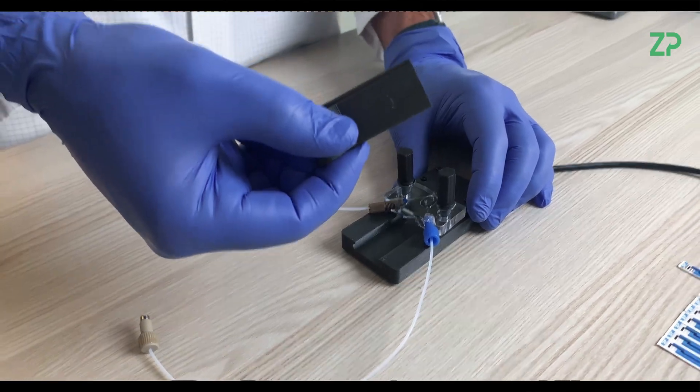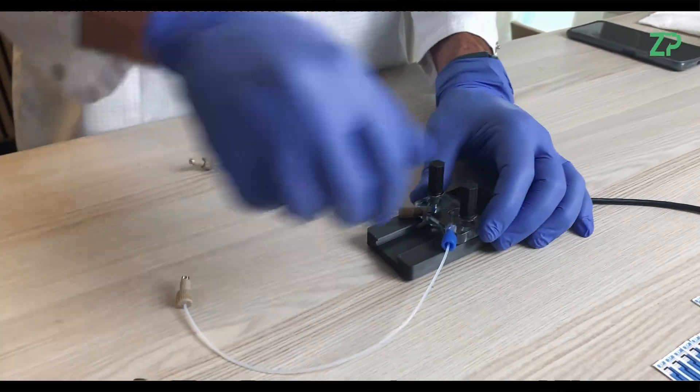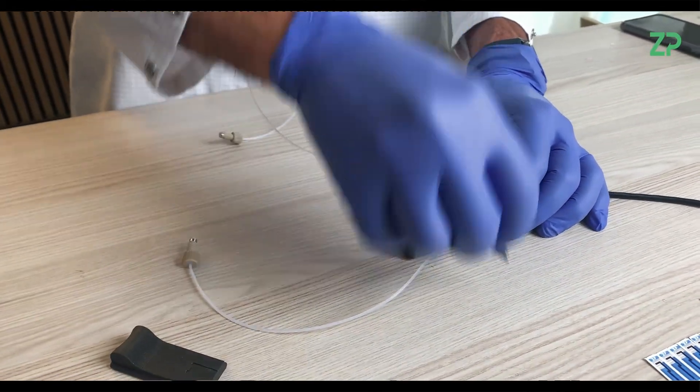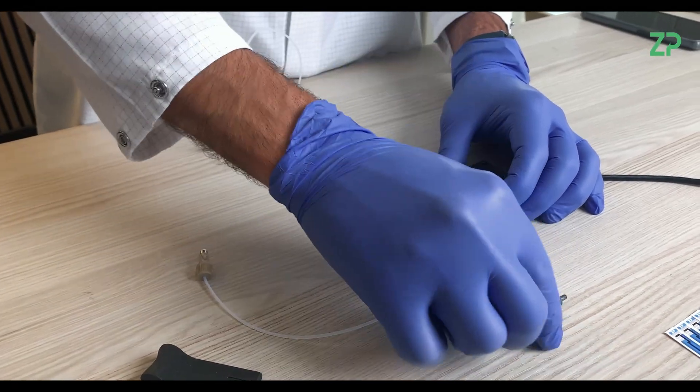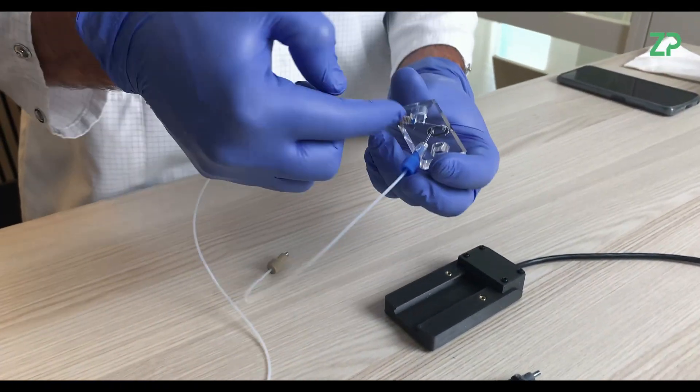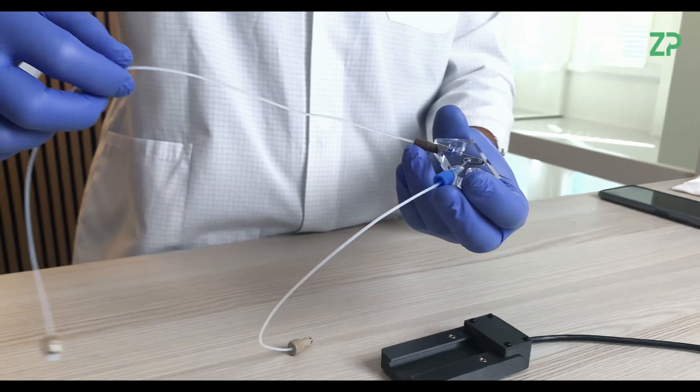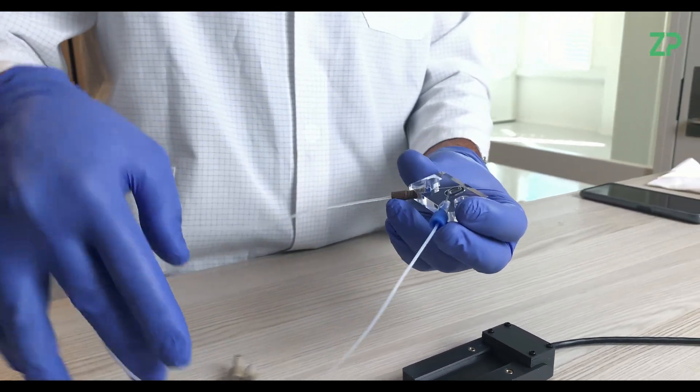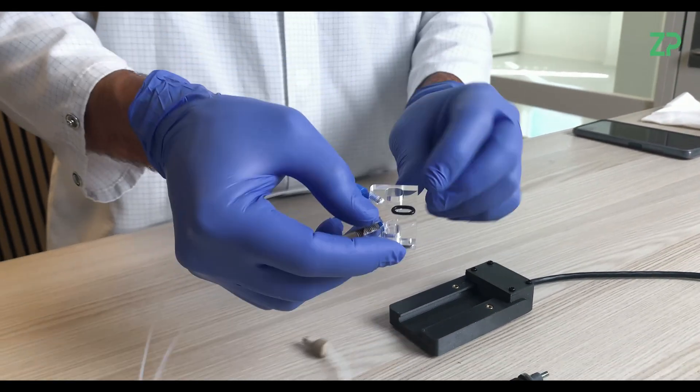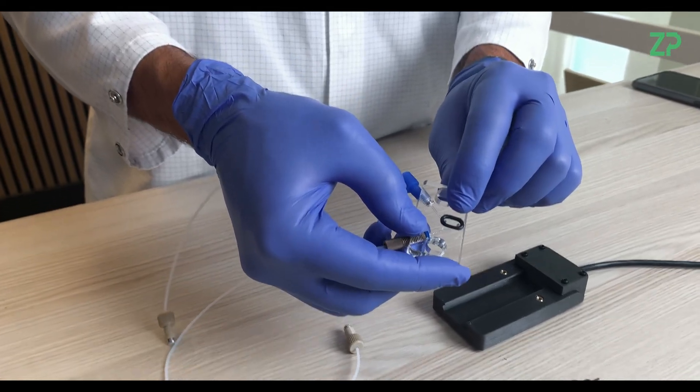So basically, this capillary field adapter is made of three parts. One is actually the sensor holder, the other one has the microfluidic parts where you have the microfluidics coming in and out, so we have the flow chamber basically.